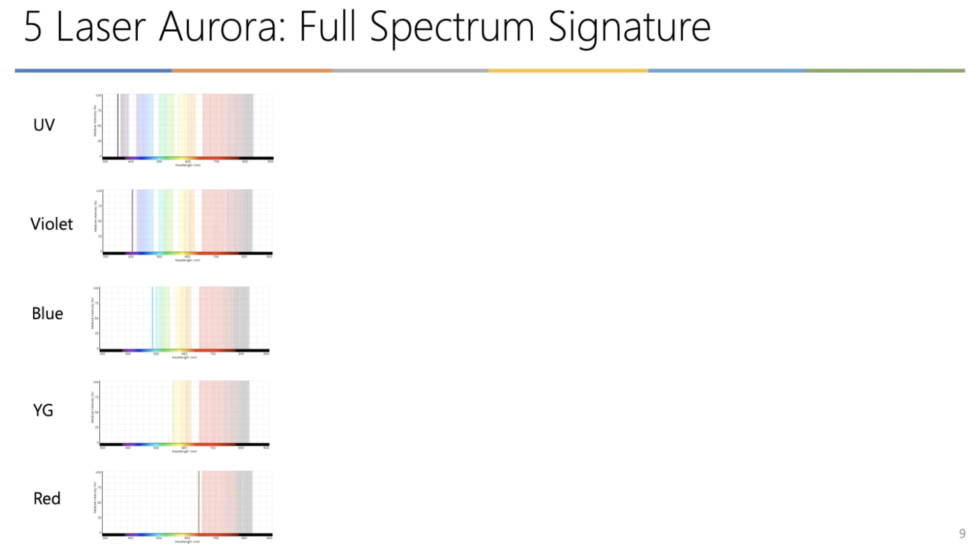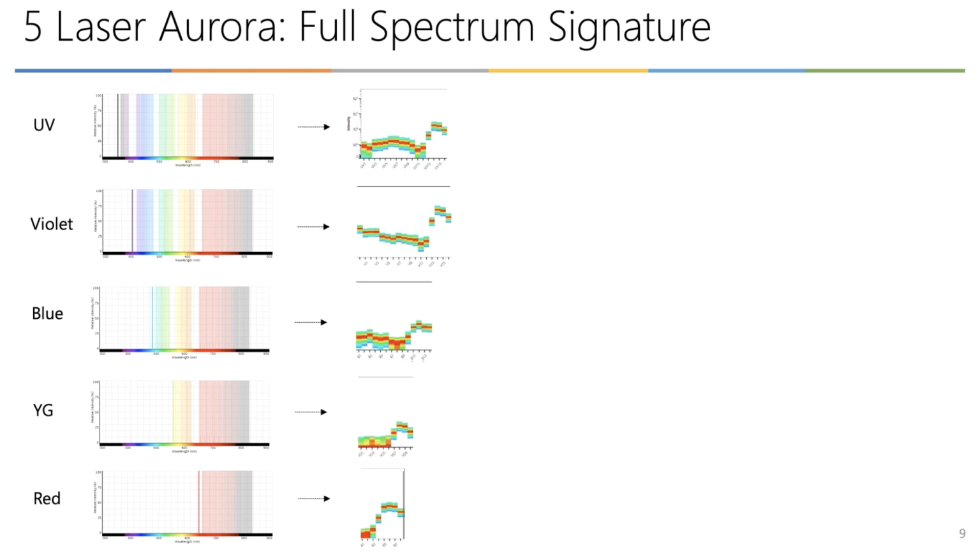And now I want to show you what happens when a particle goes through the system. So remember, we have these very special detector modules. And here is an example of a particle that went through the system. That particle was labeled with a specific fluorochrome. Through the excitation by each of the lasers, we're going to detect the signal, the MFI, that is the intensity represented in the y-axis of these plots that just appeared. The emission or intensity through the different detectors is in the x-axis.